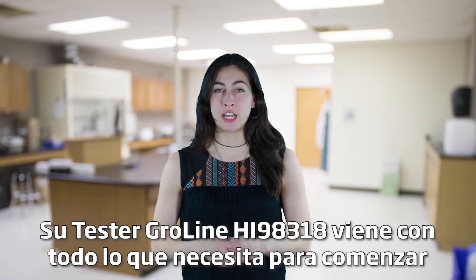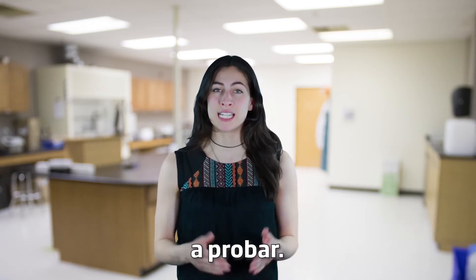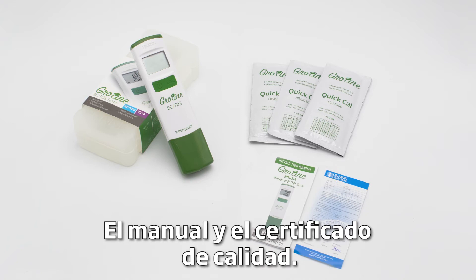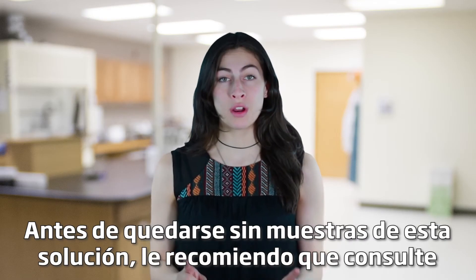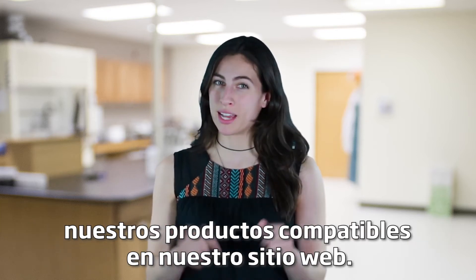Your HI-98318 GroLine tester comes with everything you need to begin testing. Along with the tester comes our GroLine quick calibration packets, the manual, and quality certificate. Before running out of these solution samples, I recommend you check our compatible products on our website.